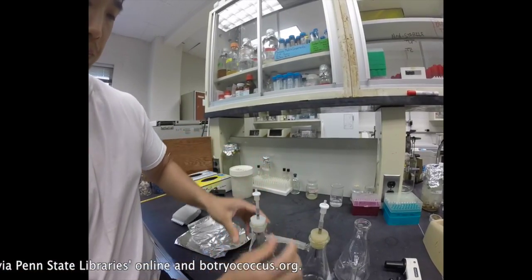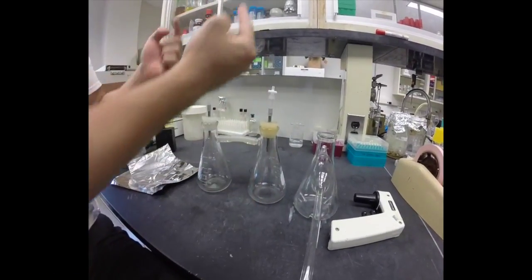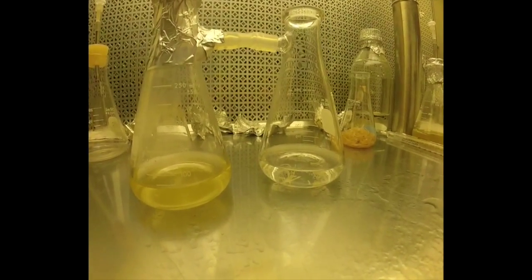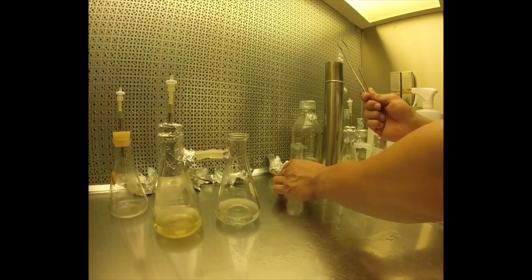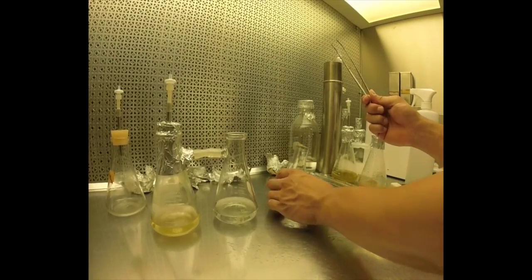There should be enough of a pressure drop so that the oxygen and the CO2 can diffuse through the tubing as opposed to going through the filters, so that the botry and the roots can supplement each other and grow well. The roots we grow in B5 medium, which has sucrose in it, so the roots will consume the sucrose and oxygen and release CO2, which will then diffuse over and feed the botry, which is growing photoautotrophically, which will then consume the CO2 and give off oxygen, which will go back to the roots.